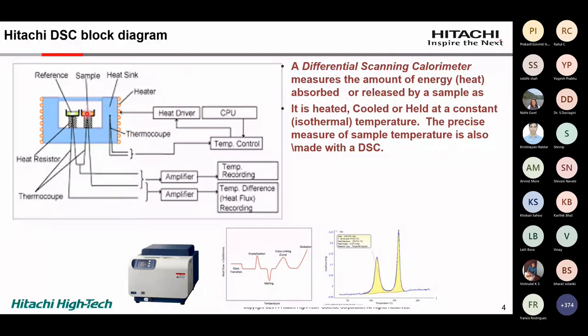As long as there is no change in the benzoic acid, the temperature of the sample and the temperature of the reference will remain the same. As soon as benzoic acid starts melting, which is an endothermic reaction, these two thermopile sensors, placed just below the sample and reference, will immediately recognize that melting, or endothermic reaction, of the sample has occurred.